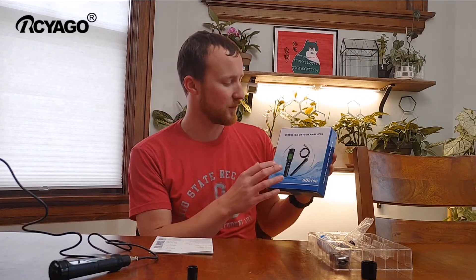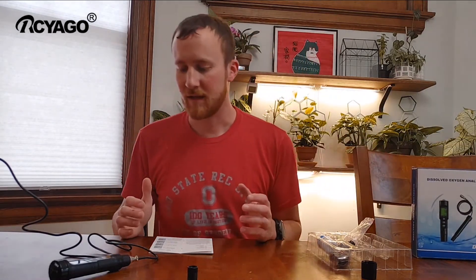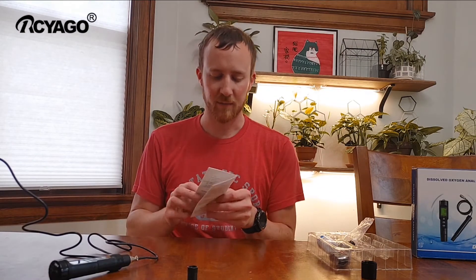Hi, today I want to do a review of the DO9100 dissolved oxygen analyzer meter. This is a pretty nice little meter here.